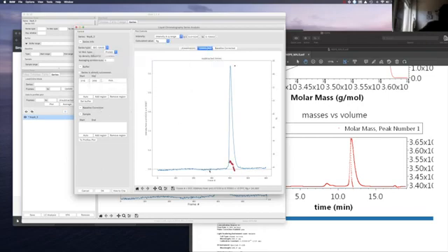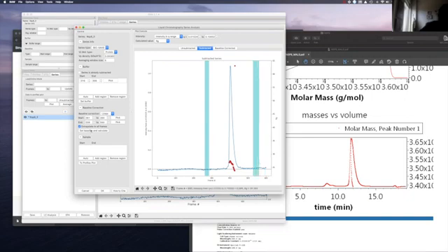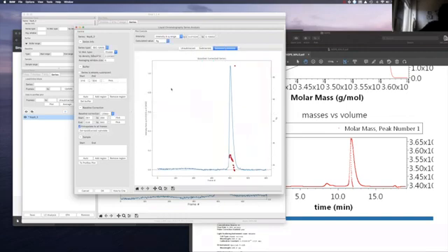Next, what I see here is a little bit of capillary fouling, very minimal, but to be sure that we are not including it, we do baseline correction. We click linear and do baseline correction. I personally think that you can keep it this way, but if you want to be sure, there is a kind of void here. We're just going to have a linear adjustment here, set the baseline and calculate. Ignore the complaining, and you see the baseline is much smoother now across the peak.